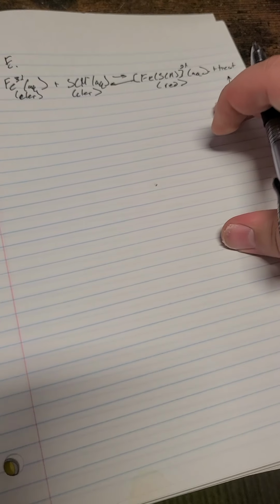The reaction is exothermic, so heat can be written over here as a product. When the heat is increased, it'll cause a shift left in the reaction, thus the orange-reddish color produced as a result of the heat being introduced.